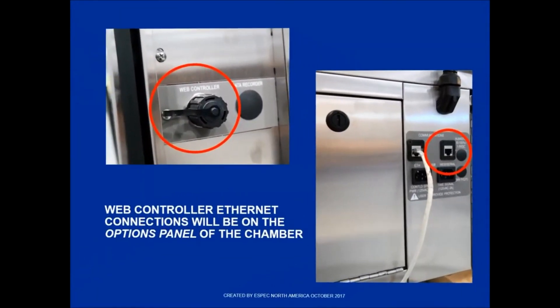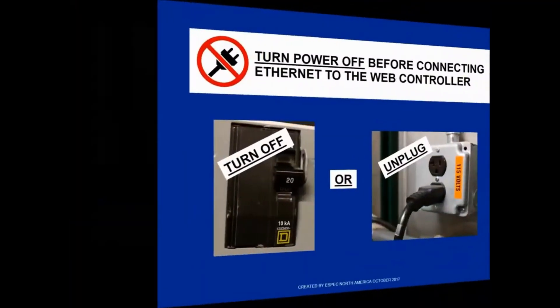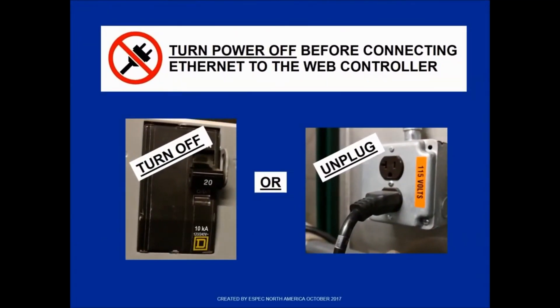If you have a web controller, you will have an Ethernet connection labeled 'web controller' on the options panel on the side of your chamber. To assure the web controller is detected and its location can be found, turn off all the power to the chamber before plugging in the controller Ethernet cord.